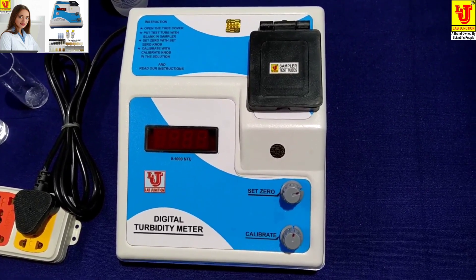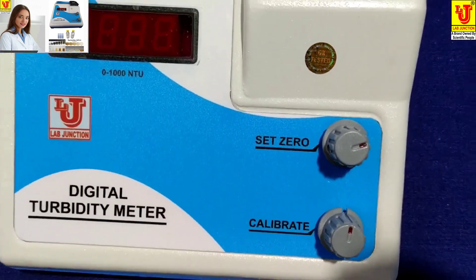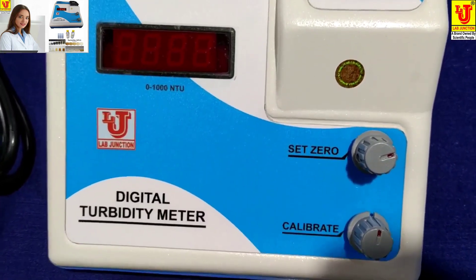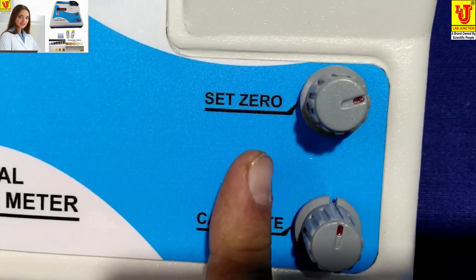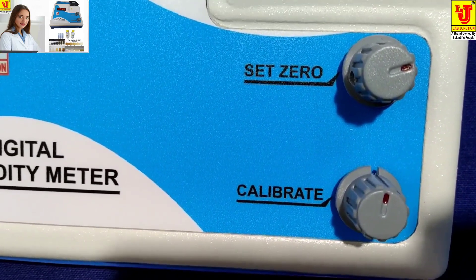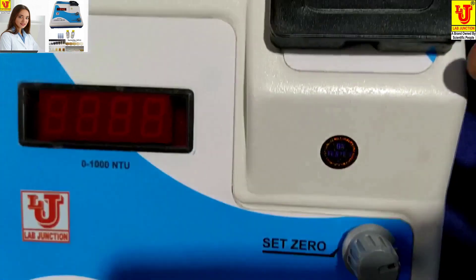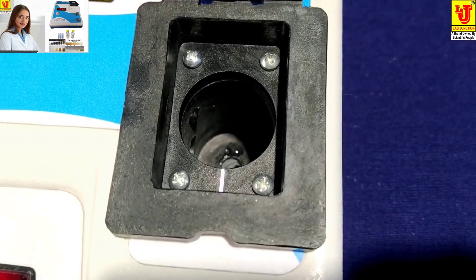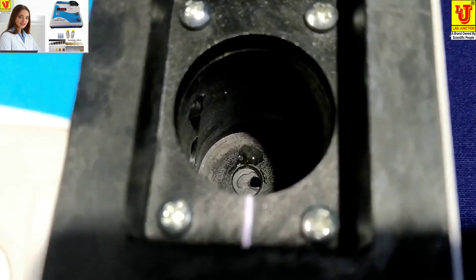This is our main unit and this is the front view. In the front view, this is the display and these are the two controls. One is Set 0 for setting zero, and one is Calibrate for calibration of the standard. This is the sample compartment for keeping sample test tubes in the sample holder.